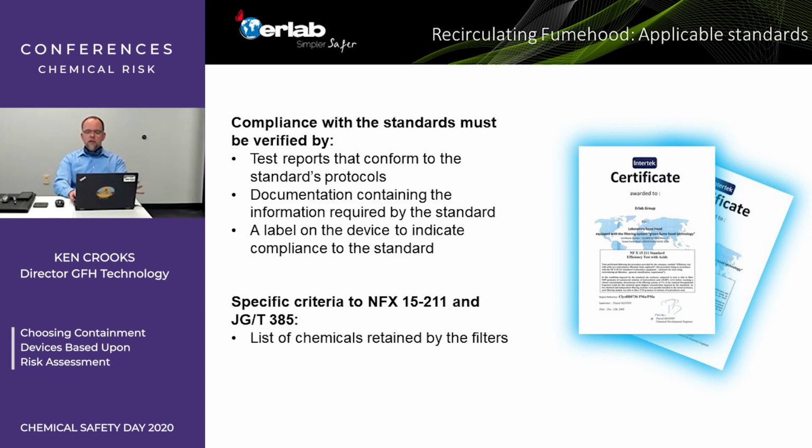Compliance: make sure the manufacturer of your ductless hoods is in full compliance and has certificates from independent third-party test companies that they comply fully with these different standards depending upon where you are. Makes perfect sense. The same thing for the fume hood enclosure. This is for the filtration, but the same applies to the actual enclosure itself. You want to make sure everybody's been tested properly to the standards in your region and has passed that with third-party testing, not just their own testing.